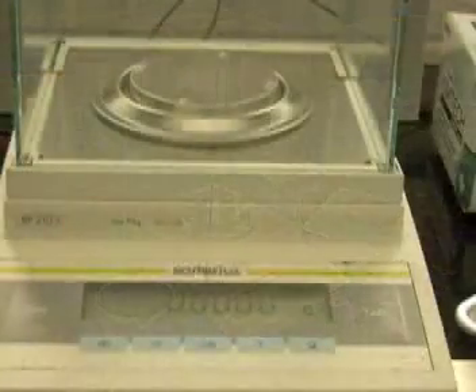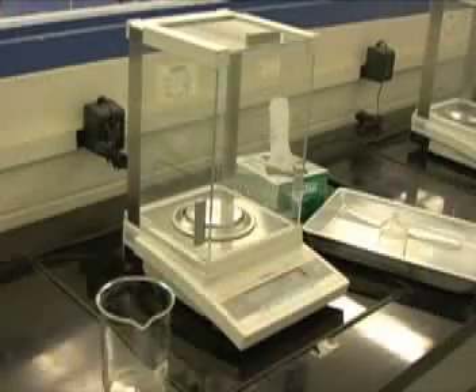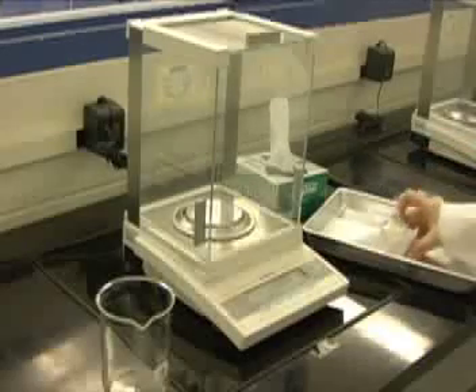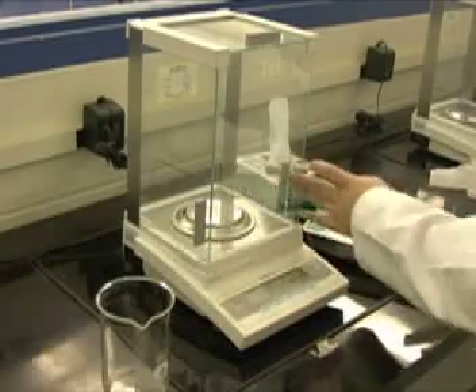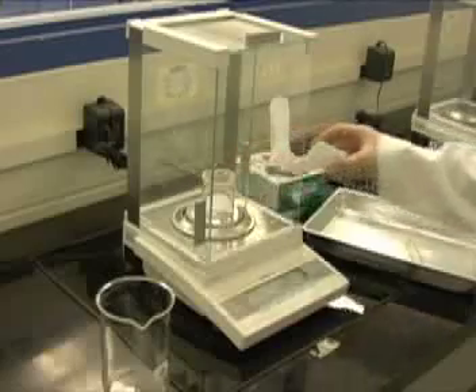Before weighing your sample, ensure that there are no residual substances on the balance and that the balance reads 0.0000 grams. When weighing with the analytical balance, never touch the containers carrying your sample with your bare hands. Any oil or dirt transferred onto the glass will skew your weighing. Instead, use a tray and a kimwipe or a strip of paper to transport your glassware.